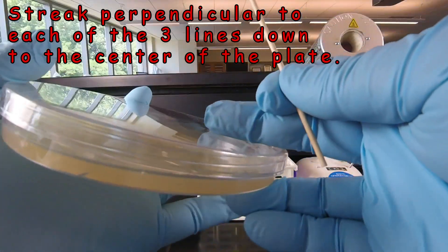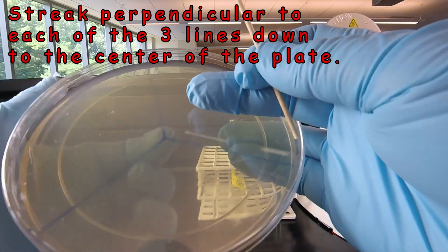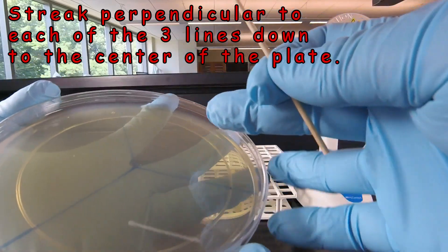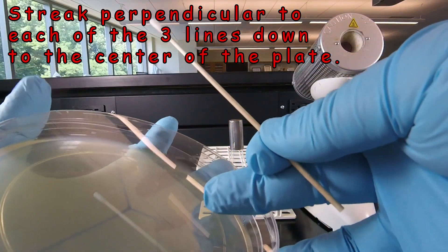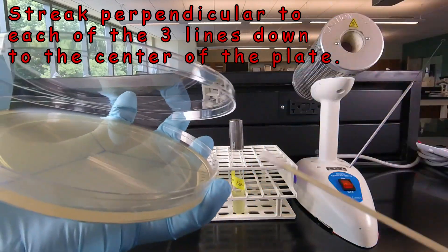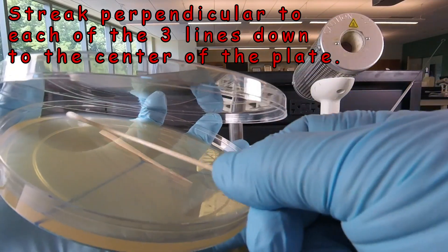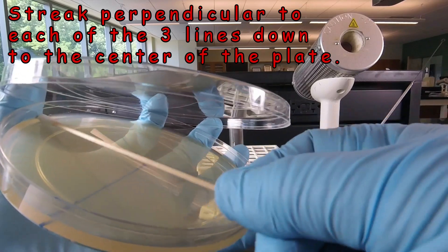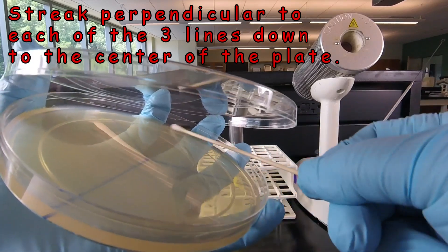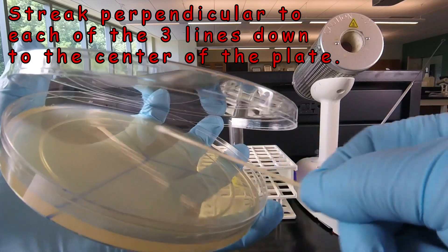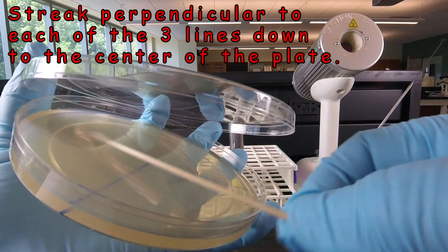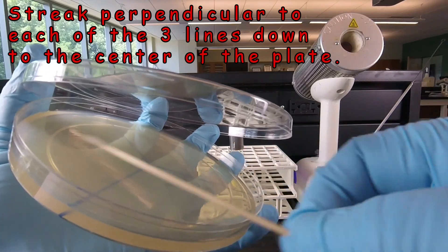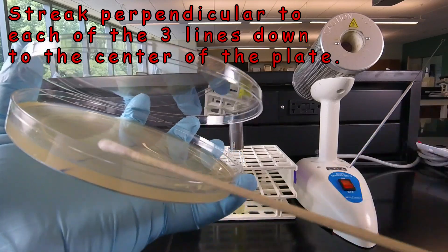Now we're going to rotate the plate and streak perpendicular to this line. Again all the way to the edge, and all the way to the center. Use the same swab. You don't have to dip it in again. So again all the way to the edge, overlapping the lines, until we hit the center.